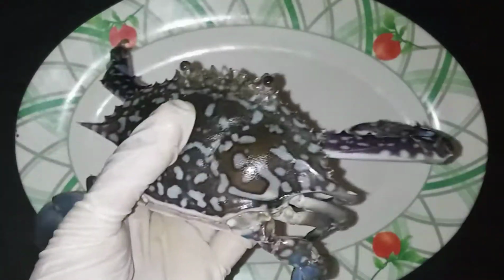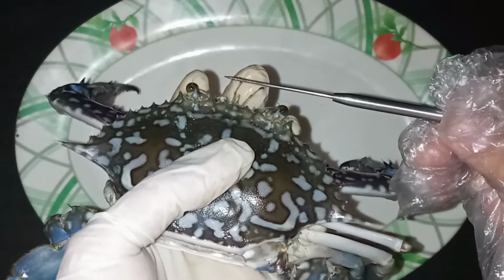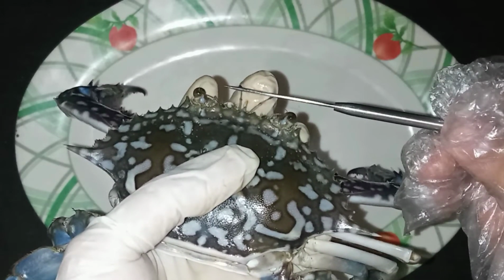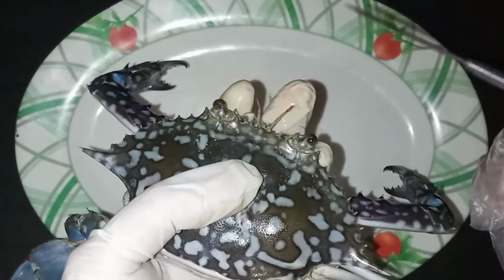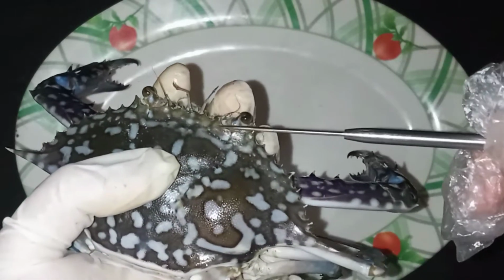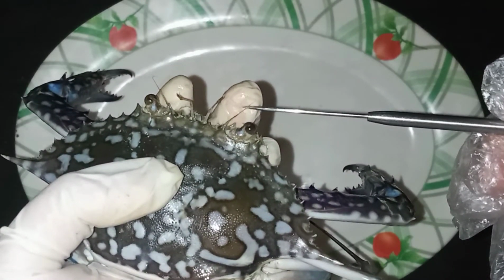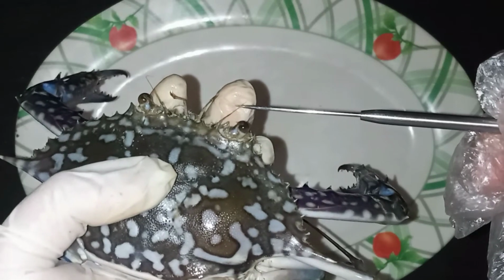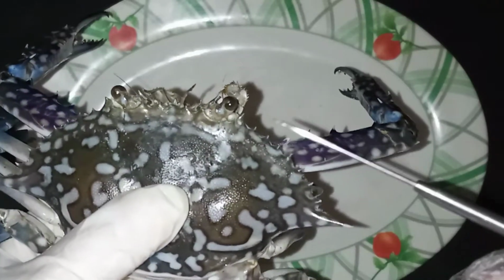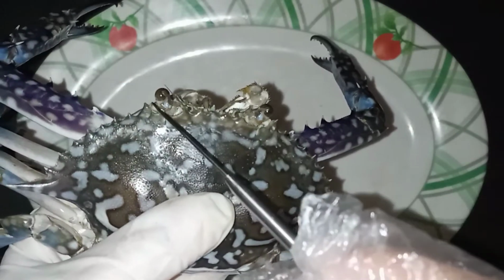On the other part, these longer ones are called the antennae, and they allow the crab to interact with its environment. These shorter ones are called the antennules, and these are the sensory organs that they use to smell and taste. We also have this part of a crab that is called the eye stalk, and on its tip is where the eye is located.